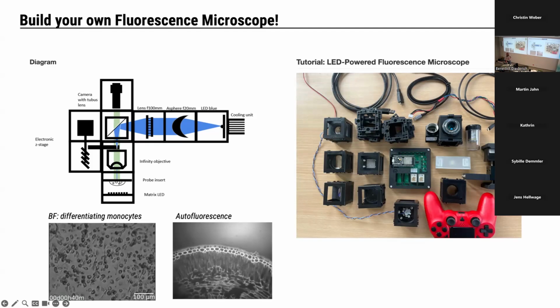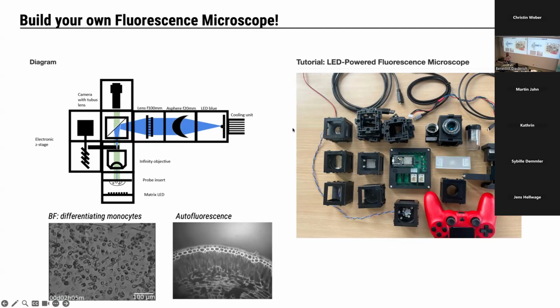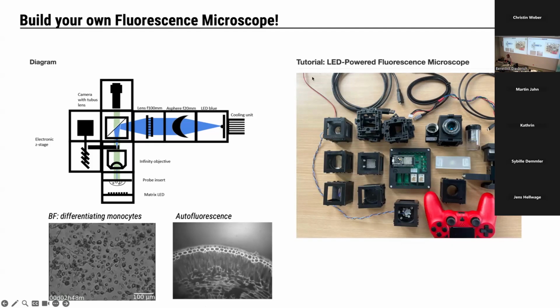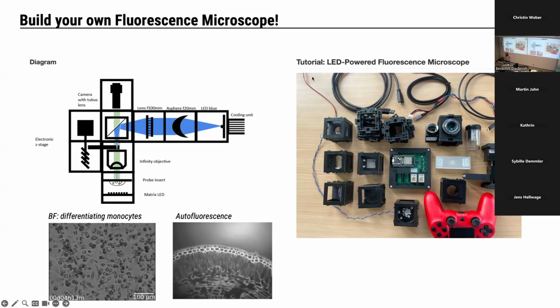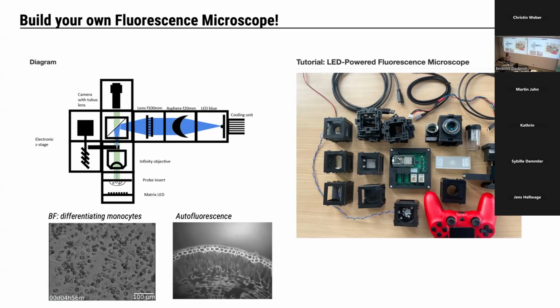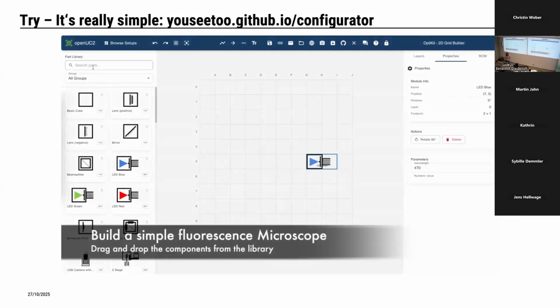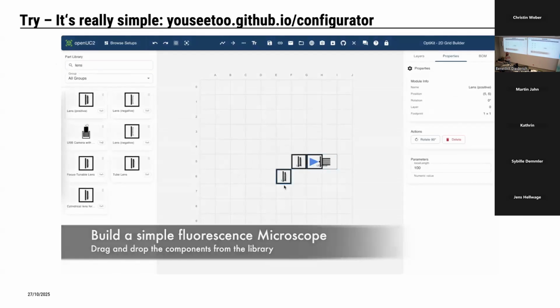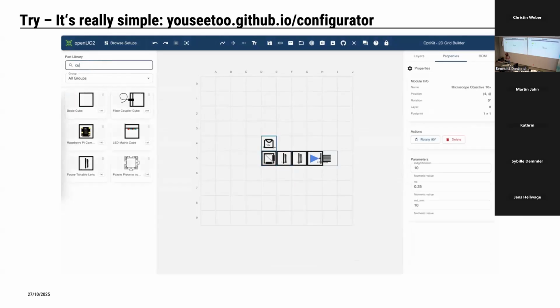And so just some examples here. You can use this whole thing in an incubator for fluorescence. In that case, it's autofluorescence. And since not everybody can do it, because maybe that's also some of the knowledge that we have built up over the last few years, we decided, okay, we want to open this up so that people actually have the ability to experience what components are actually available, and how you can construct that.